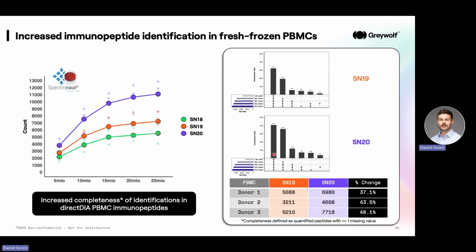And then quite logically, the next largest set had everything in but 5 million, because 5 million obviously has the lowest number of peptide IDs. And then if you work your way down this, 10 million drops out and 15 million and so on. So this was really, really promising to see.